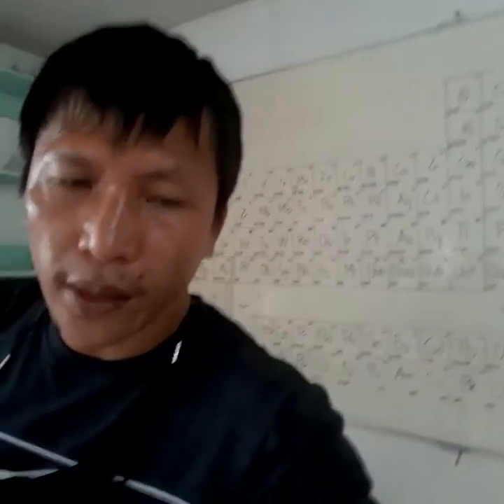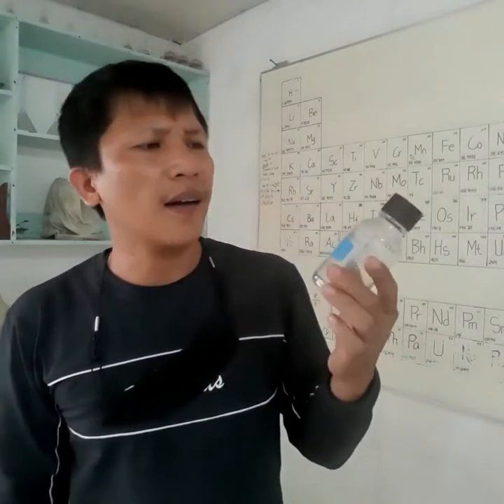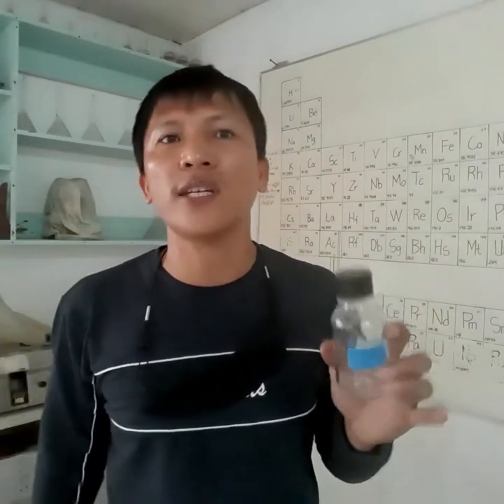Next would be vials. This one is a sample vial. What's different about vials is that they are covered with screwed plastic caps like this one. Vials are usually used when you're going to the field to collect your samples. For example, water sampling is very common. You'll be using vials to put your samples in, just like this sample vial.